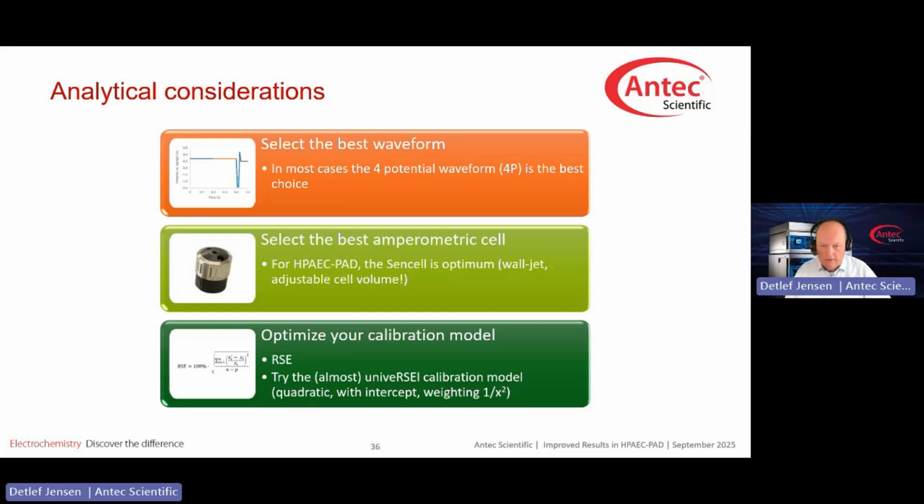Optimize your calibration model effectively. We discussed the RSE parameter as a way to interpret and compare calibration models. Just try it out. Remember, don't do extra work or measurements. Just use existing data and compare the results in the simplest way. RSE is a tool that does not affect the calibration itself, but it provides useful insights to guide your decision.